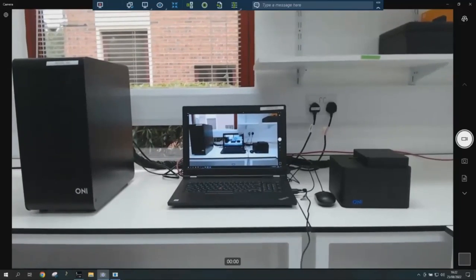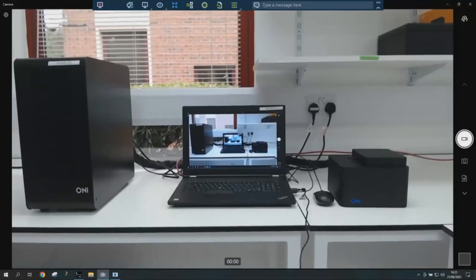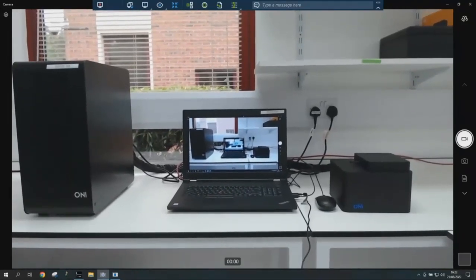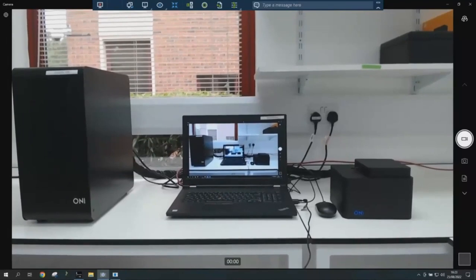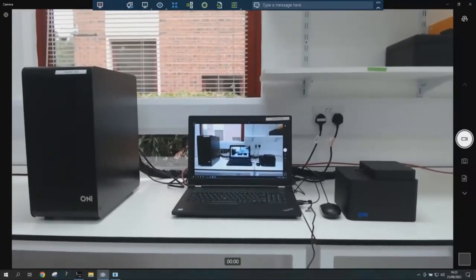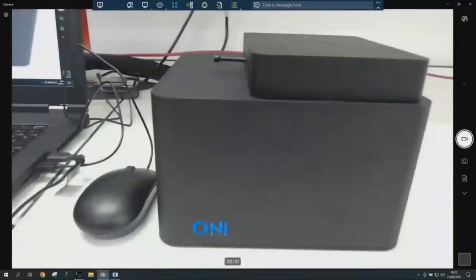This is basically the Nanoimager technical part. So a regular table on the lab bench in the wet lab, and lights are on, even the window is open. And you can see here the features. My colleague Siobhan in Oxford will show us the Nanoimager.